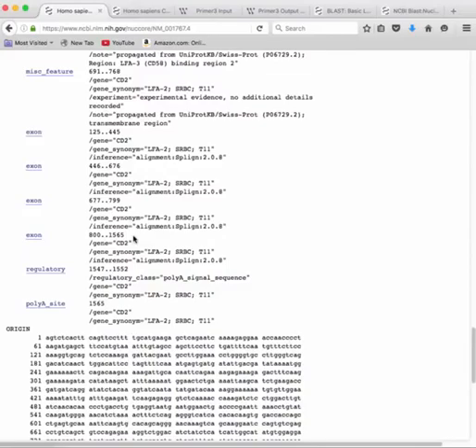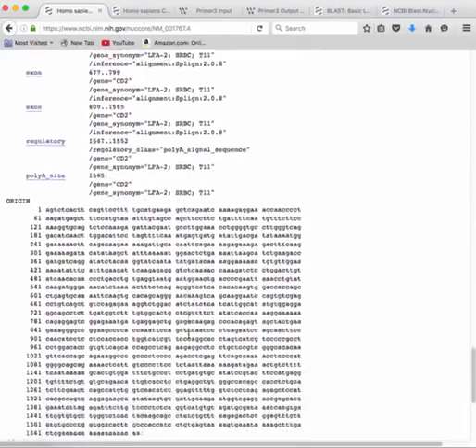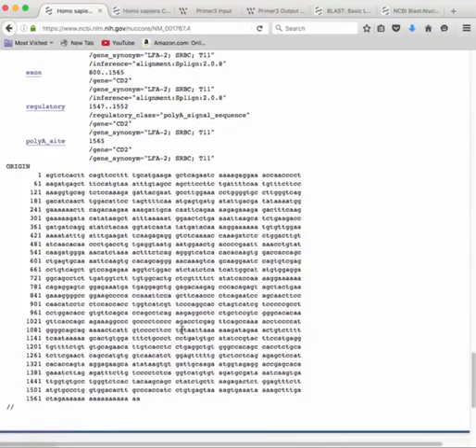You have to target a certain exon for your design, because you want to design primers or probes at the junctions of exons. So you have to target the start point of one of those exons.